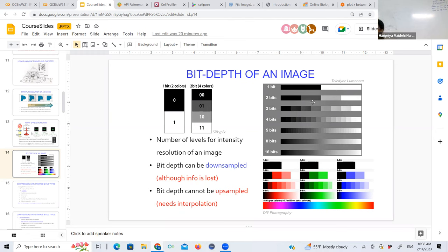So when you take an image, take it at the highest possible bit depth. You can throw out information if you don't care about it, but you cannot create information that doesn't exist. Always keep that in mind. Just because you saved an 8-bit image as 16-bit doesn't mean it magically became 16-bit. It just means you did something that is potentially considered an unethical manipulation of data.